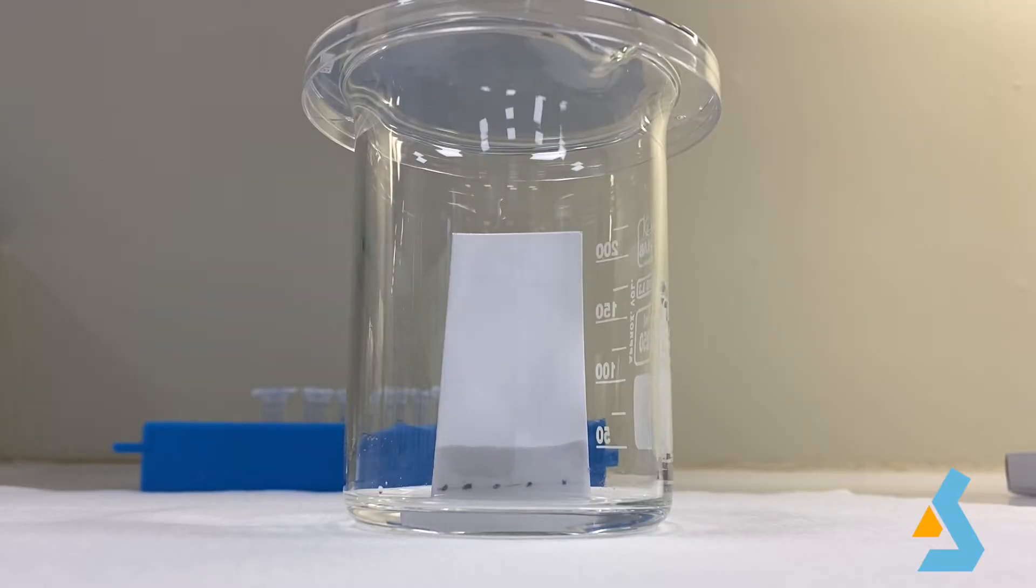Now, the solvent, which is the mobile phase, will begin to rise up the plate, which is the stationary phase. We will let the solvent rise up until there is 5-10 mm space at the top of the plate.